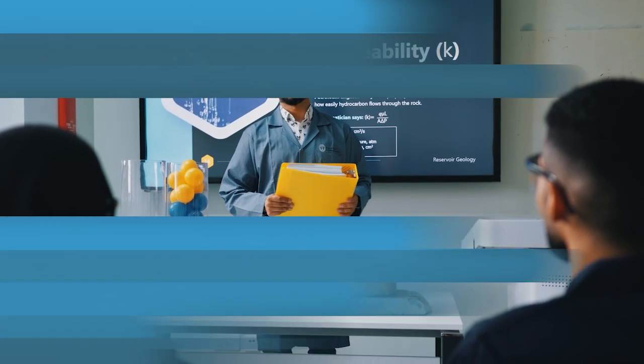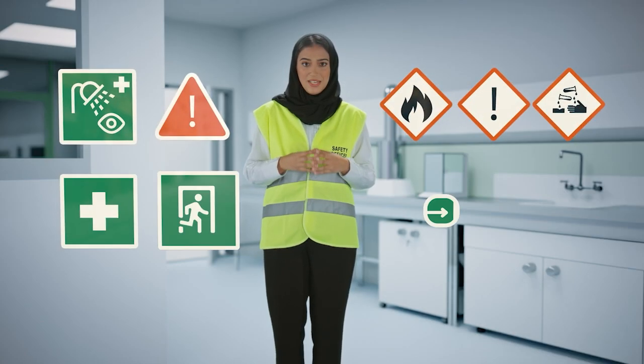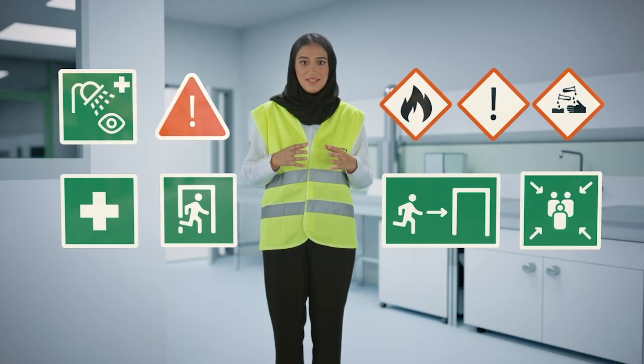Although each laboratory is governed by its own specific rules and regulations, some of the fundamental safety rules are in common. In this video, you will be exposed to general laboratory safety and the basic safety principles that apply across the board.